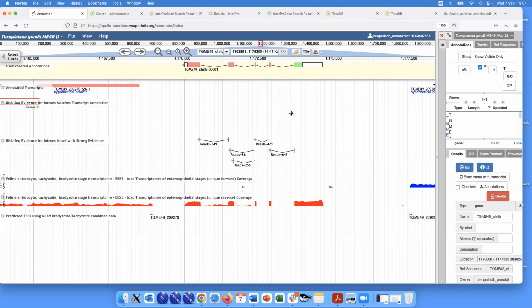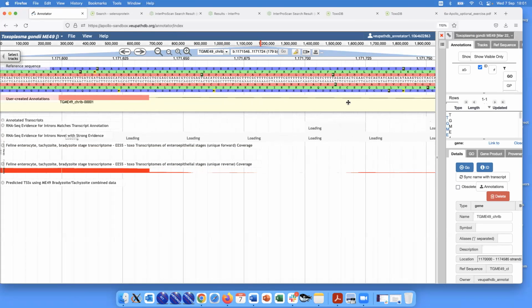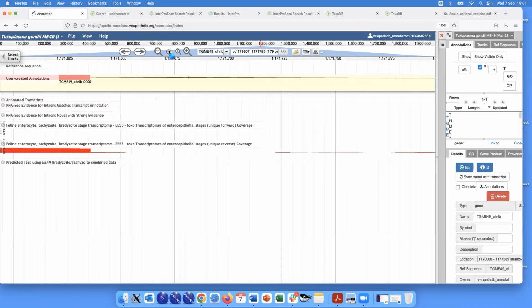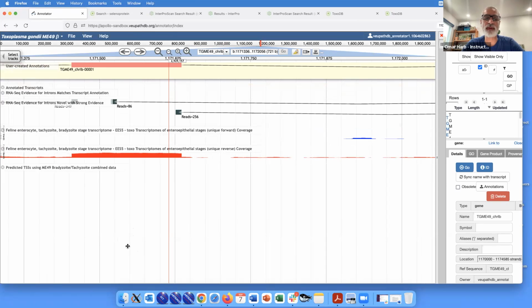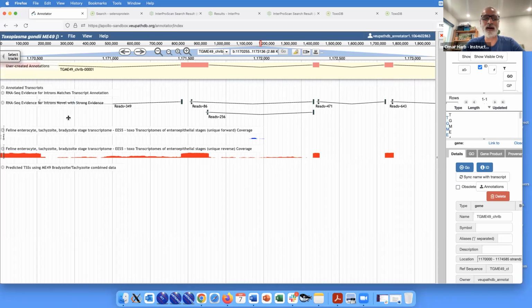Maybe she's talking about the incorrect splice boundaries, Uli, when they are not correct. No, it's like a large stretch where instead of seeing the nucleotides, it's just question marks. I can send you the gene so that you can take a look at it. Definitely do that. We'll take a look and see if it's possible that some character is not being parsed properly and it's showing up as question marks, or maybe there should be something else. It'll be very good to see what that is.